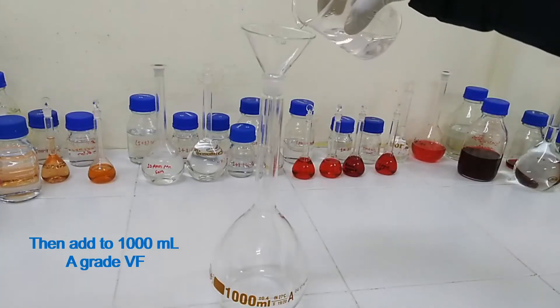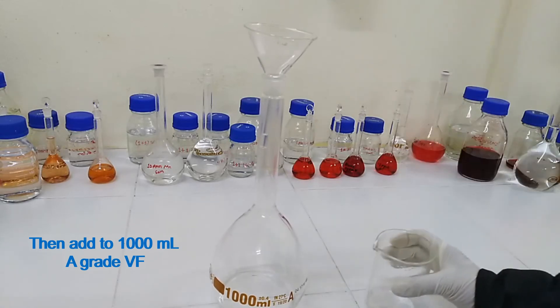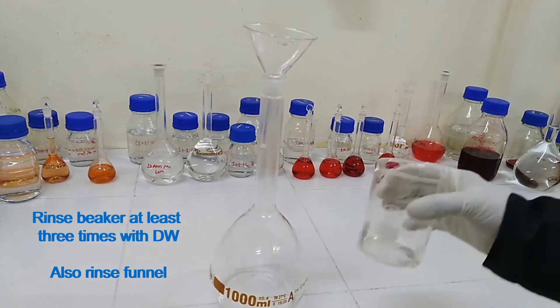Then transfer to a 1000 ml A grade volumetric flask. Rinse the beaker at least 3 times with distilled water and also rinse the funnel.